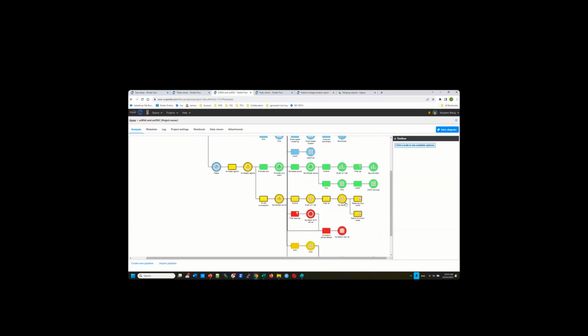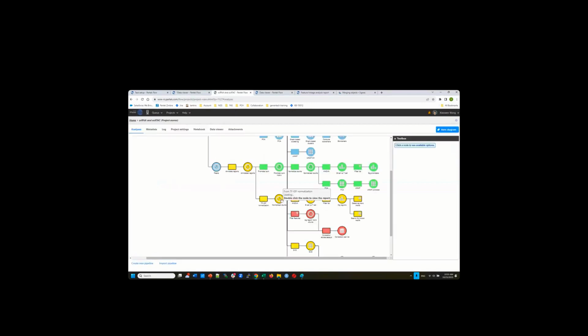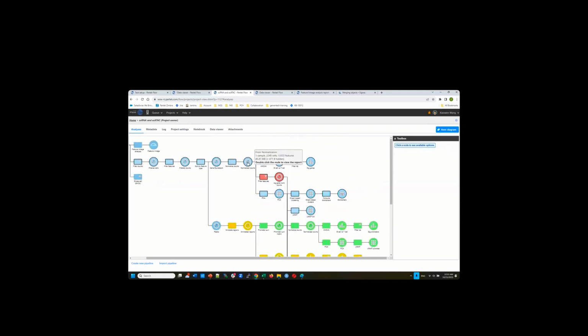So you're going to use your significant regions to filter your normalized count. Basically, once you have a feature list, you save it, and then when you choose a filter, you use the filter feature and choose a filter based on a list. So you create a list, choose the list and filter on it. This is what I performed before: 2248 cells with 82,000 features. After the filter, I still focus on the same 2248 cells, but only 600 features. Okay, so those are the significant ones, and do the same thing for RNA.